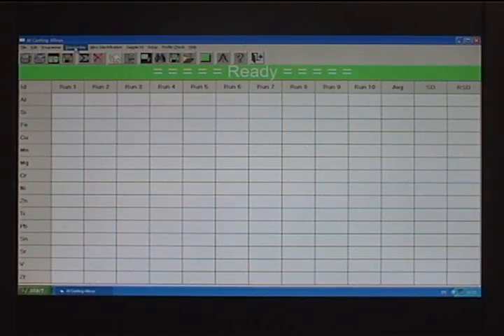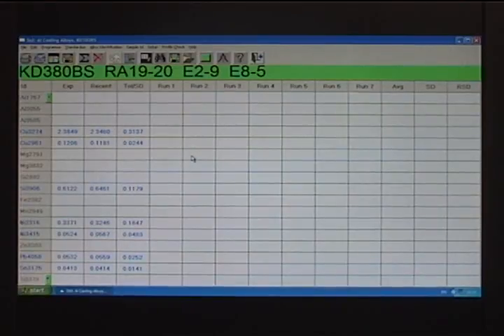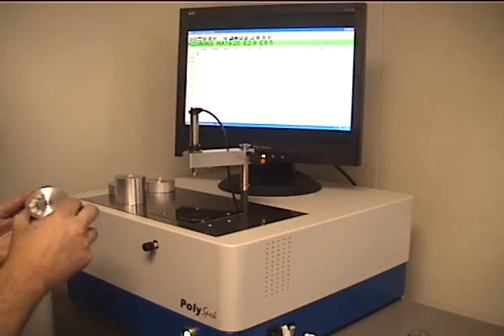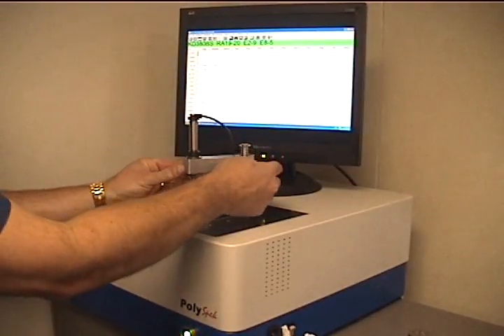One of the more routine parts of maintaining the integrity of analytical results is a process called re-standardization. This process adjusts the instrument for day-to-day variation and will help to ensure that your results are correct. This process is started by clicking on the standardize icon at the top of the screen. Once a program is selected, a list of standardization samples appears at the top of the screen. The first sample is placed on the spark stand and the start button is pushed.